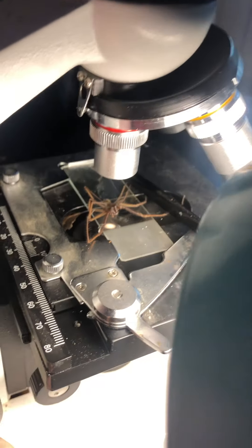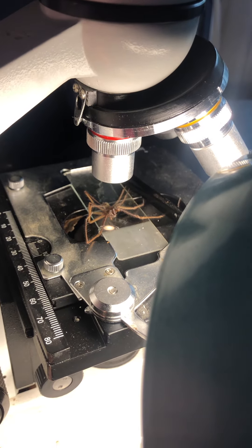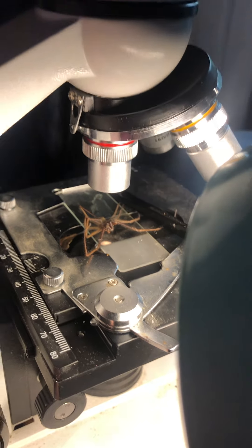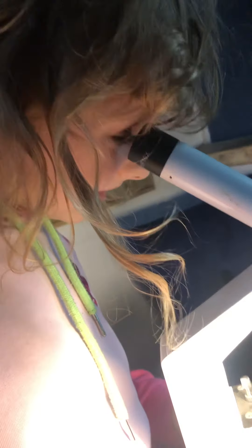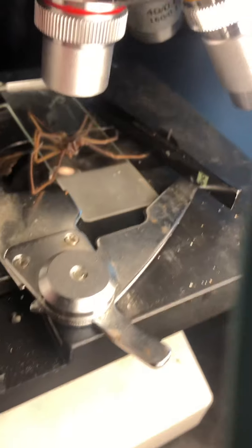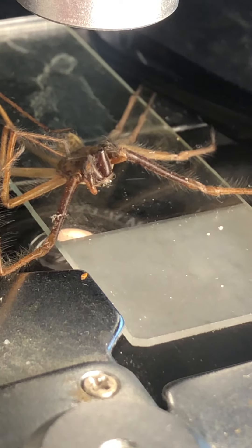I can see a pincher. A pincher. Oh, look what's going on.